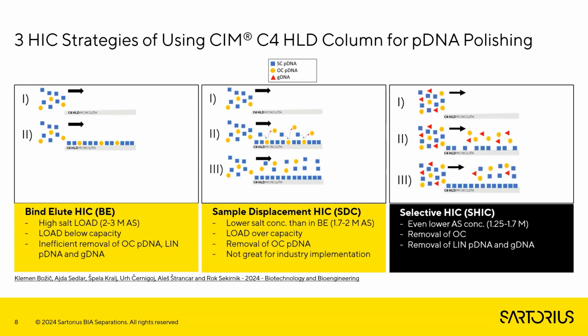Today, we would like to present a new approach, which is selective hydrophobic interaction chromatography. Here we use even lower concentrations of ammonium sulfate, preventing the impurities, so open circular, linear plasmid, and genomic DNA, from binding to the support.